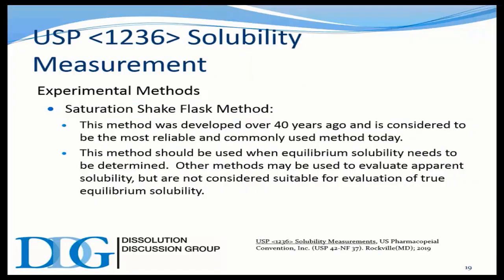Now, how do you measure solubility? Well, I wish I could say there's some groundbreaking procedure for determining thermodynamic equilibrium solubility, but there's been a method that's probably been in use closer to 50 years, and is still probably the most reliable and commonly used, and this is called the shake flask method.